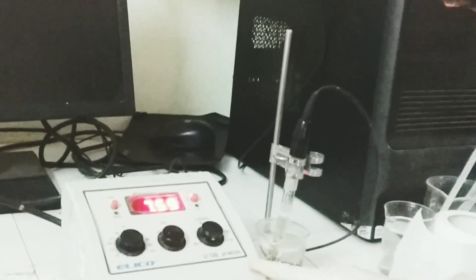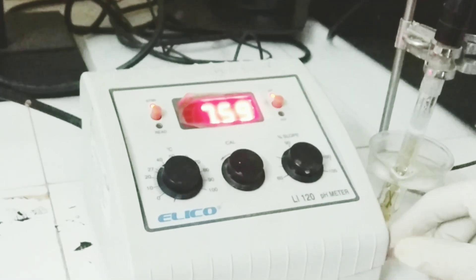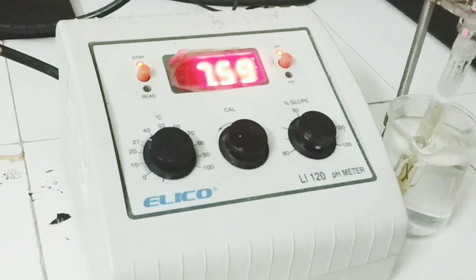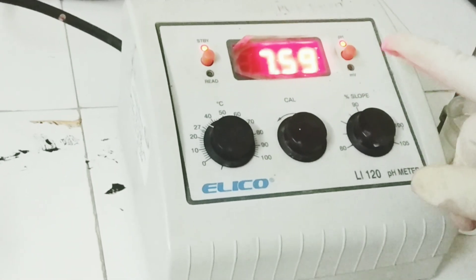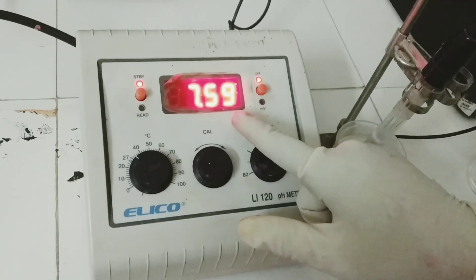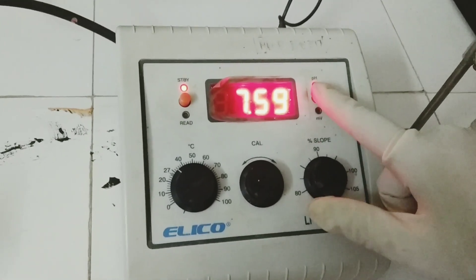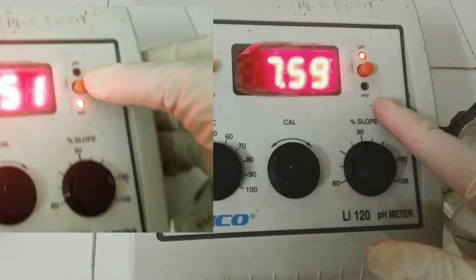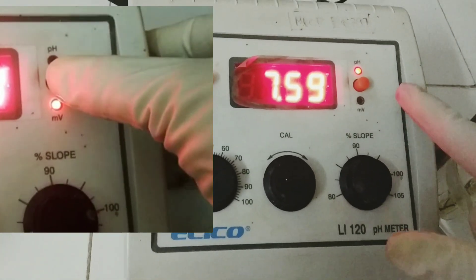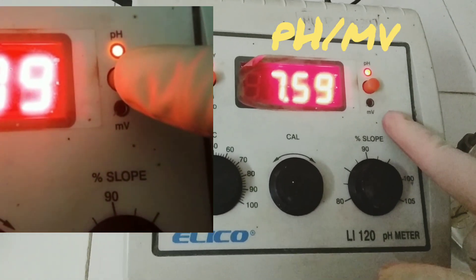Let me describe the instrument first. This is a tabletop compact pH meter, the ELICO LI120. On the display you can see certain knobs. There is a central display unit showing digital pH measurements. On the right hand side, we have a push knob. We can put the instrument in the pH mode or in the millivolt mode. When we want to measure pH, we put it in the pH mode; when we want to measure potential, we put it in the millivolt mode.